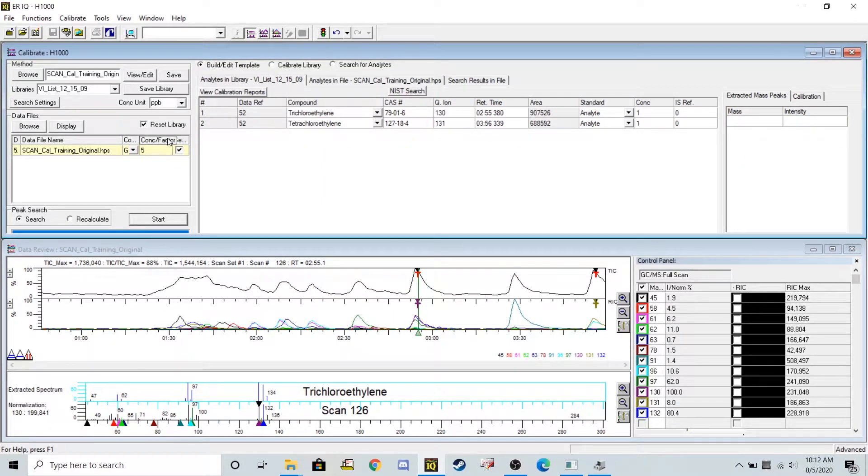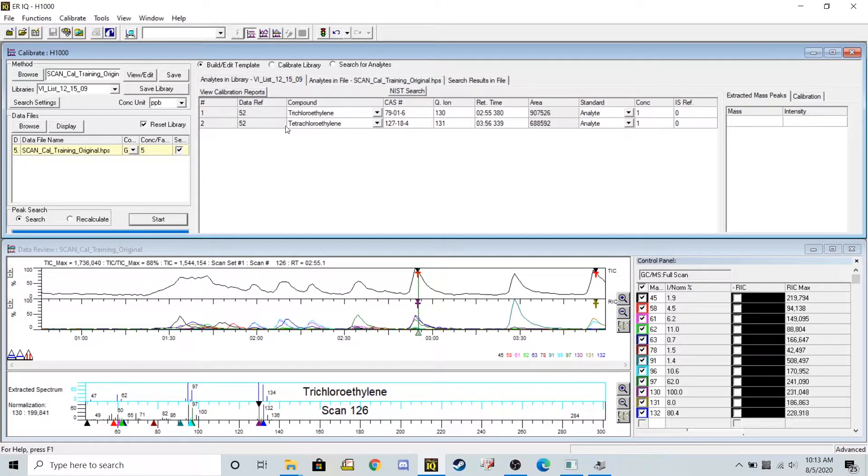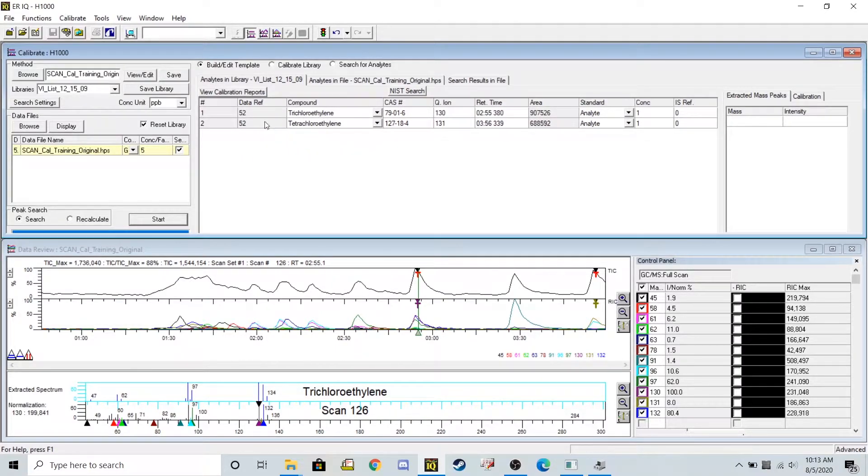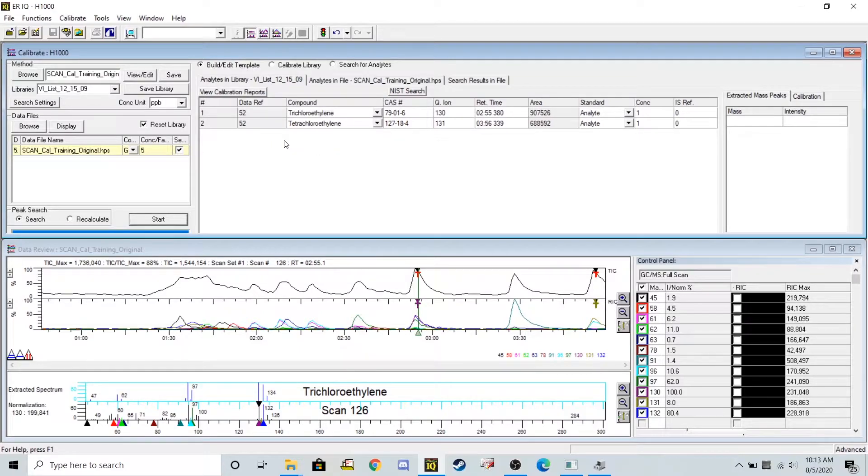On this step I'm purposely making a single mistake and it has to do with this tetrachloroethylene chemical. We'll see how that mistake affects it at the end of this run and we'll go back and fix it at the very end.